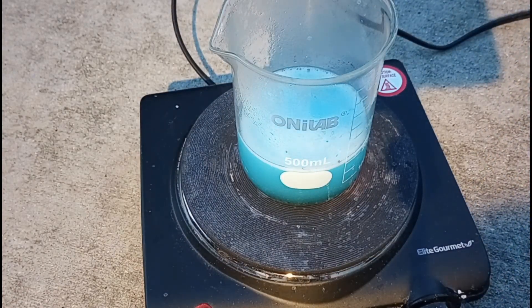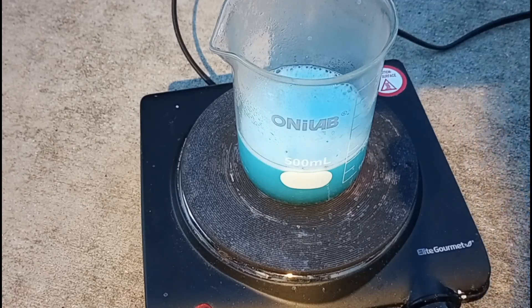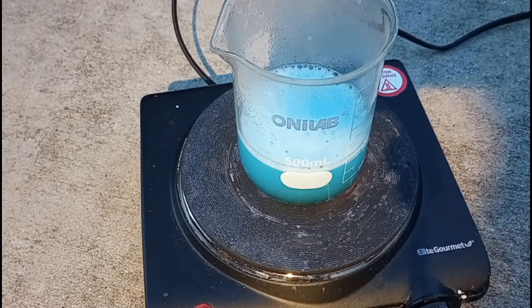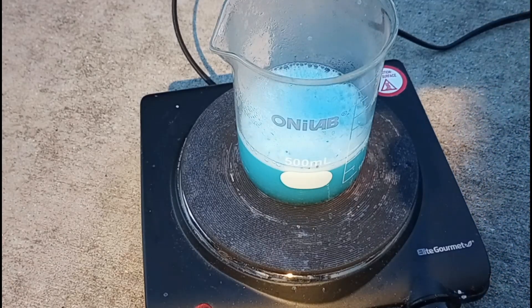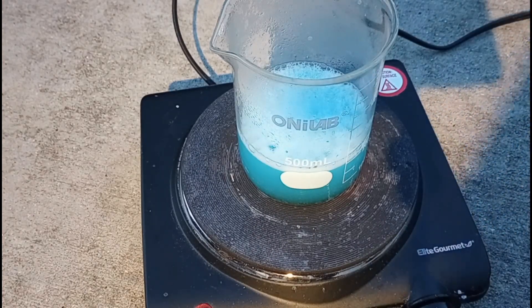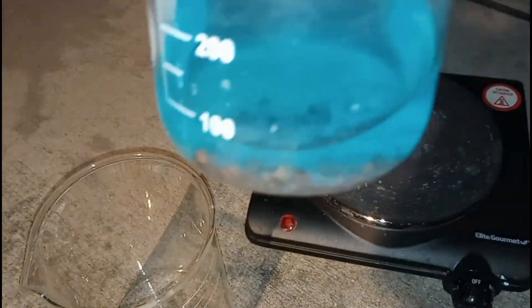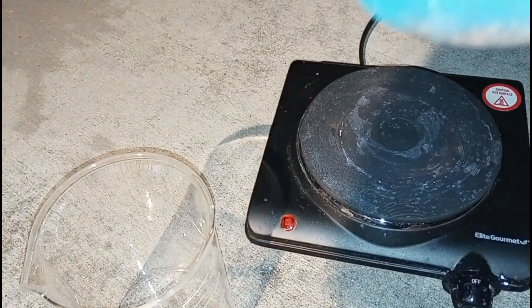Just so you know, a lot of this footage is sped up to two times the normal speed. So what we're going to do next is decant off the solution liquid into a larger beaker while it's nice and blue.